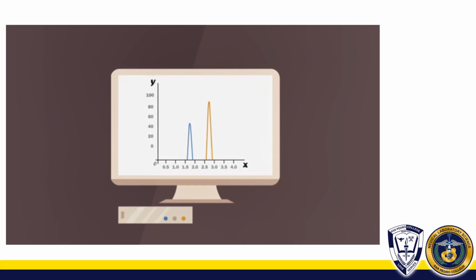Okay, so that explains how gas chromatography works. That is why it is called gas: as you can see in the video, your sample is being evaporated, and that evaporated sample is collected in the detector. The FID that you saw in the video stands for flame ionization detector. Later we will discuss it further. Basically, it is the detector.